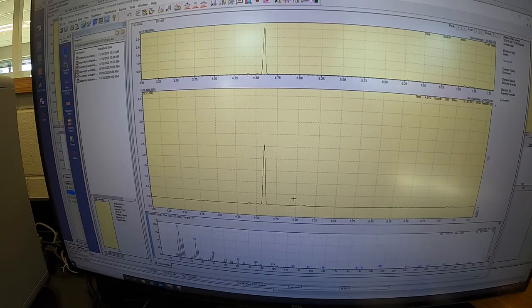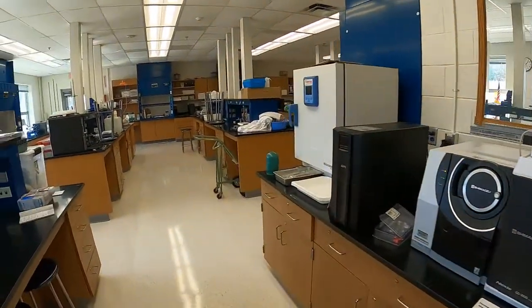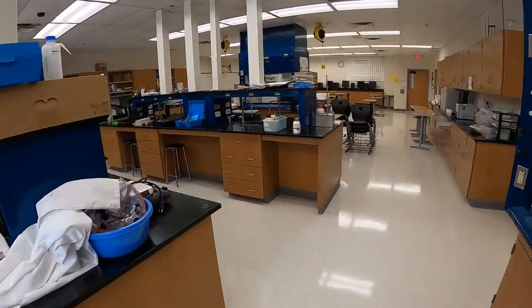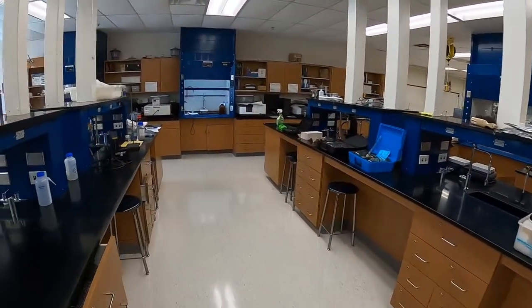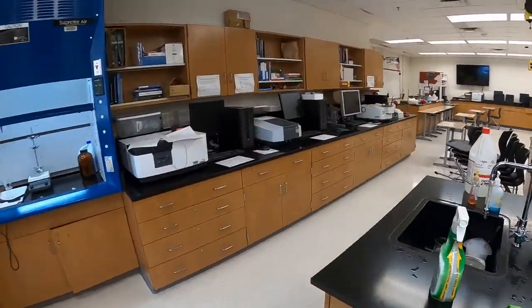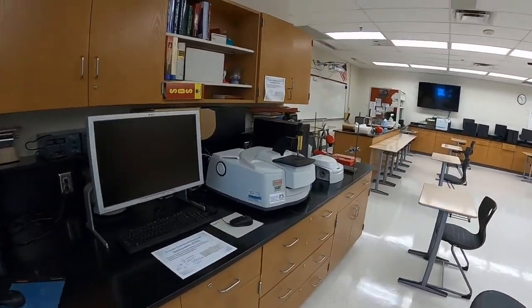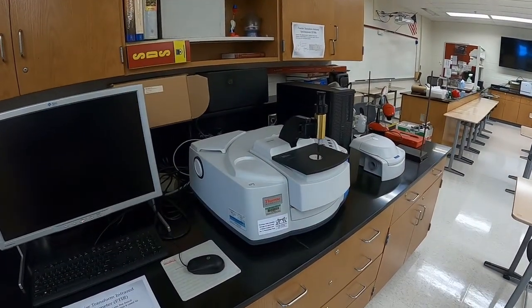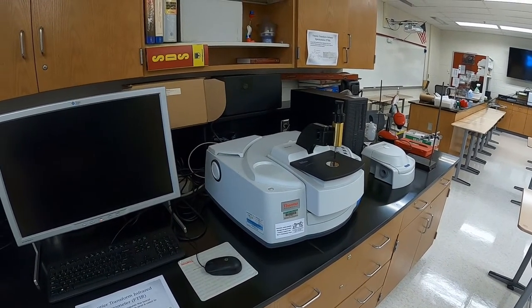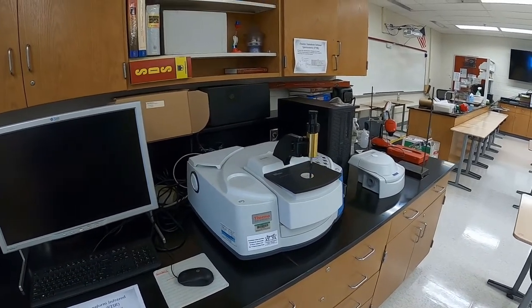Then we also have, in the handout, the IR spectrum. So we could acquire an IR spectrum for the sample, but for time's sake, I'm going to ask you to refer to the spectra in the handout. And again, here's our IR spectrometer. I could put a different sampling apparatus on there and very easily measure an IR spectrum of both the reactant and the product.